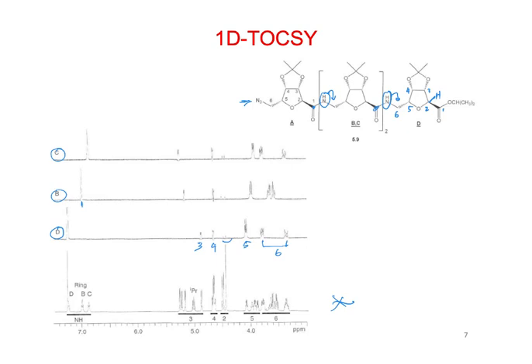All right, so that picture in there, I must have just put it in separately. So here you can see, I got this from a paper or a book or something, and that one at the top shows a pattern for a given amino acid. They had a pattern like that for all the different amino acids.